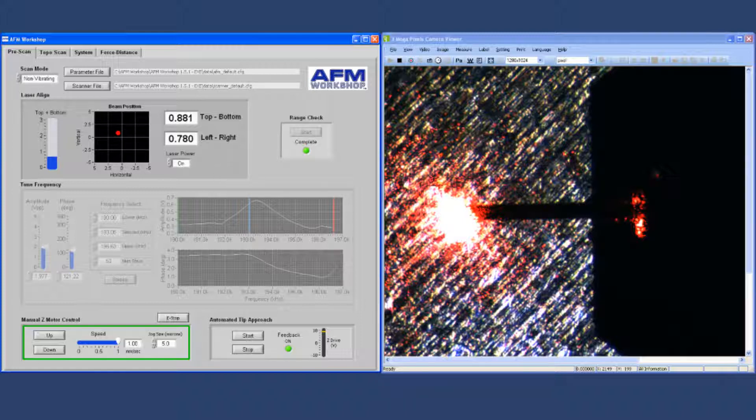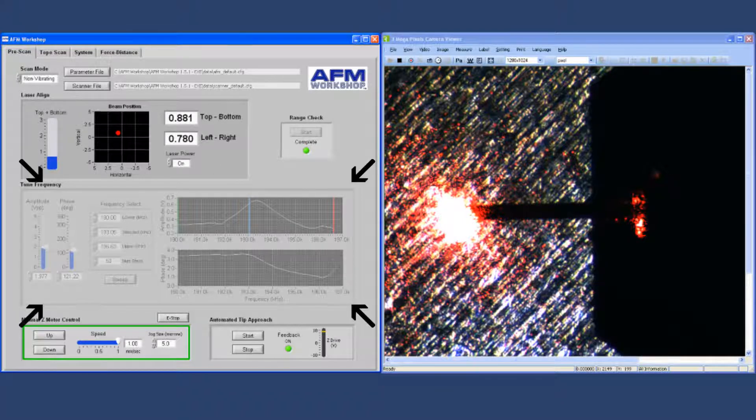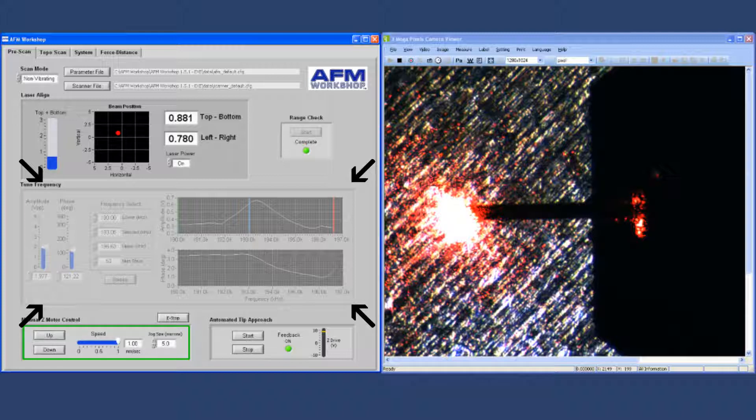Below that is the tune frequency screen, which is used for optimizing the parameters for vibrating mode.